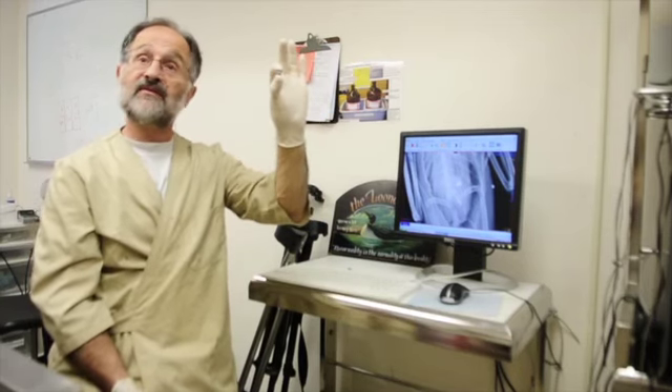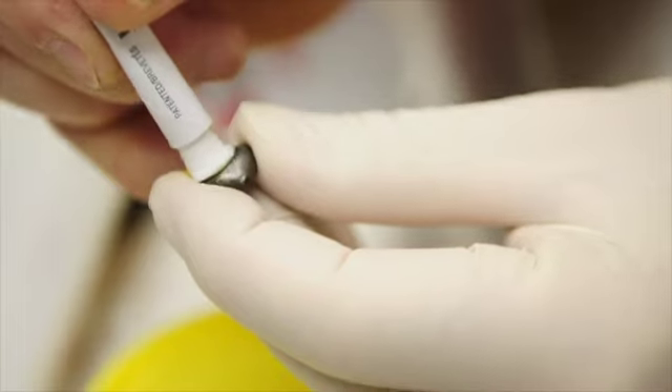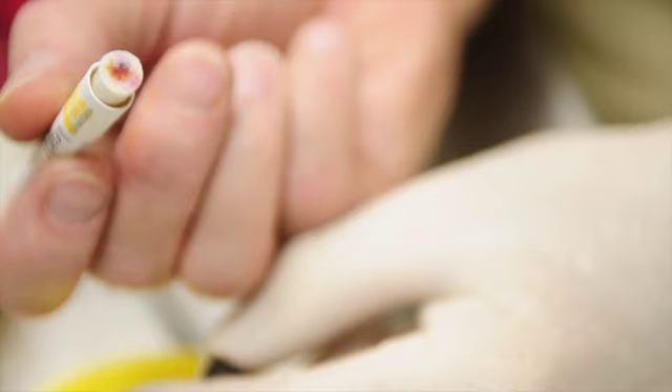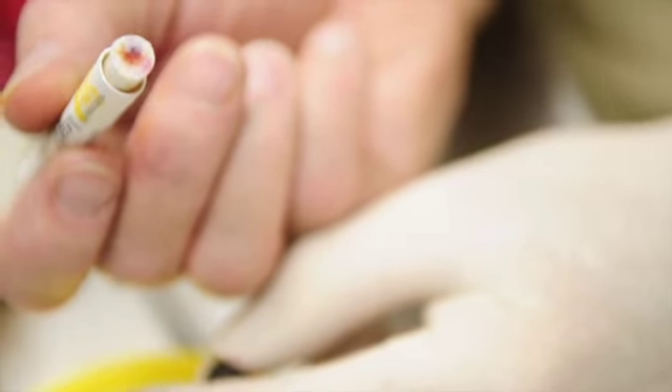Now we have to test this and make sure this is lead. It looks like lead, but we're going to test it. We're looking for a color change on the swab. That's definitive — what does that show? That it's lead. No other metal would turn that pink.